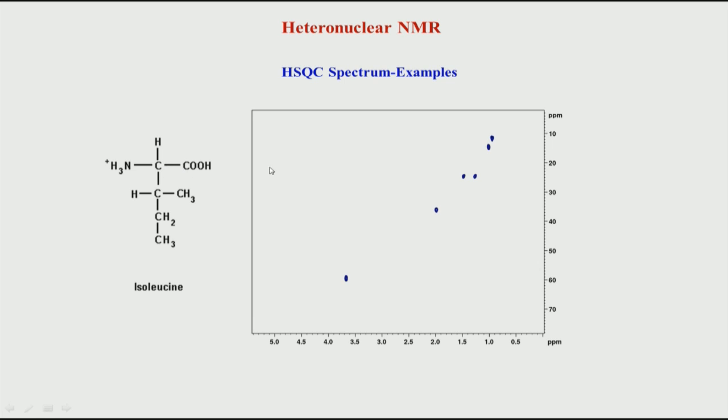Okay. So, this is actually the experimental spectrum recorded for this molecule. So, one can say that the most upfield shift, which is close to 10 ppm and around 1 ppm, has to be methyls, according to our earlier analysis where we saw that methyls are always upfield shifted. There are two methyls in this molecule. So, the second one is this methyl.